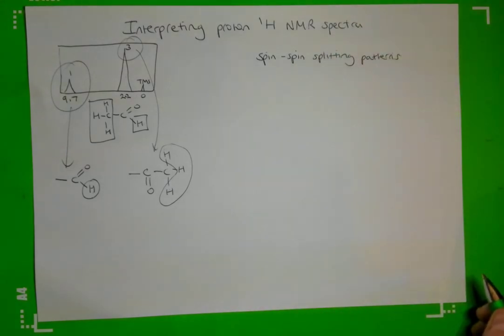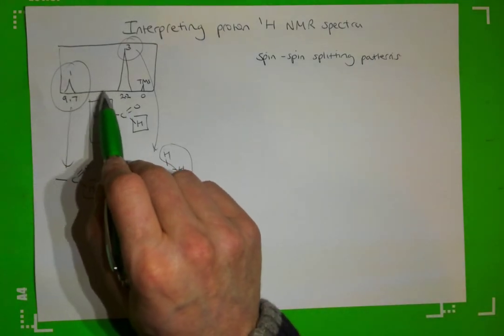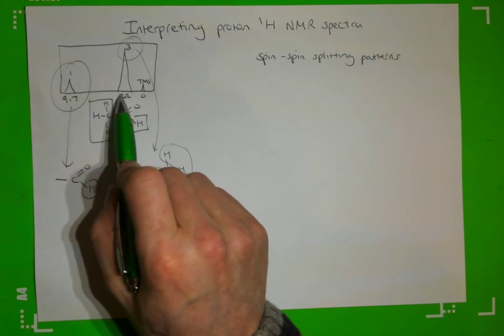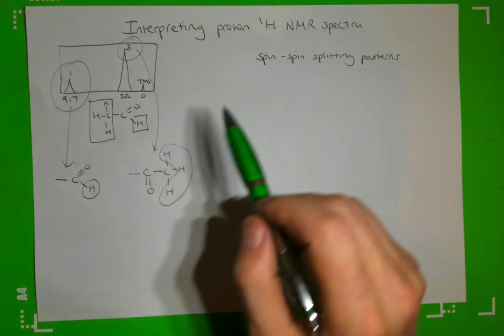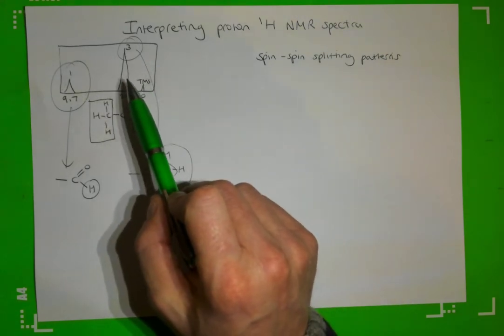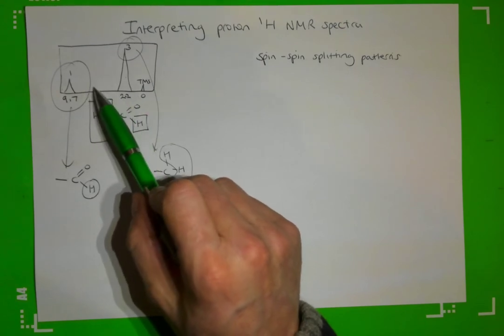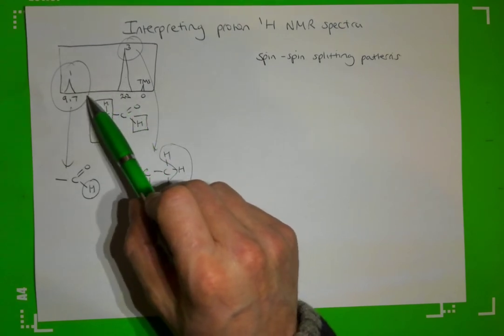This is what happens when we zoom in on NMR peaks, and the peaks themselves are actually split up into further smaller peaks. And this happens because the magnetic field felt by any hydrogen is affected by the magnetic field on the hydrogen atoms that are on neighbouring carbon atoms. We call them adjacent hydrogens.